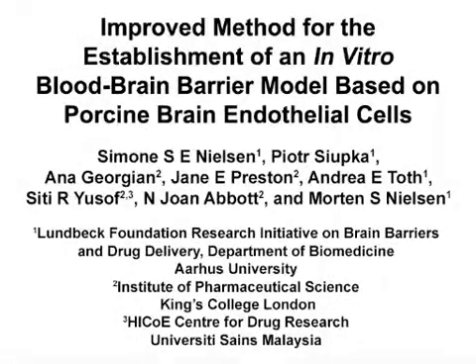The overall goal of this protocol is to purify and isolate primary porcine brain endothelial cells in order to set up a tight in vitro blood-brain barrier model.